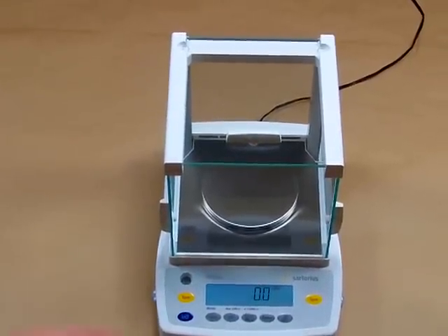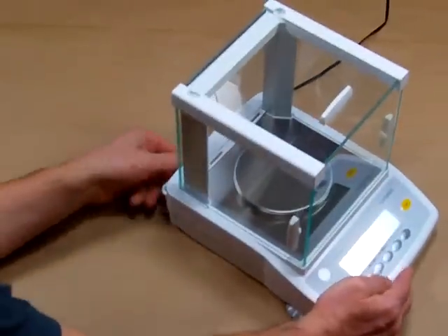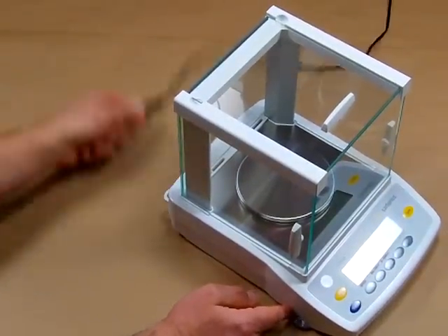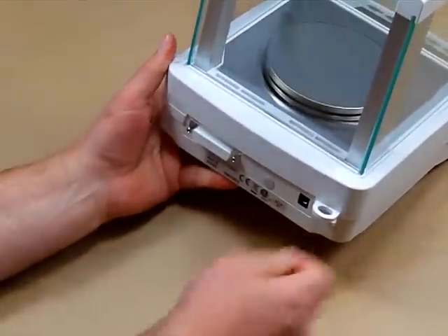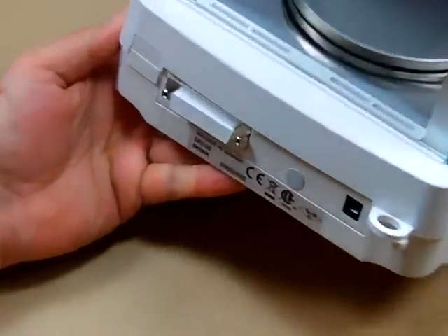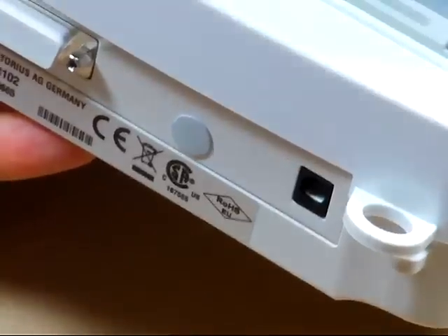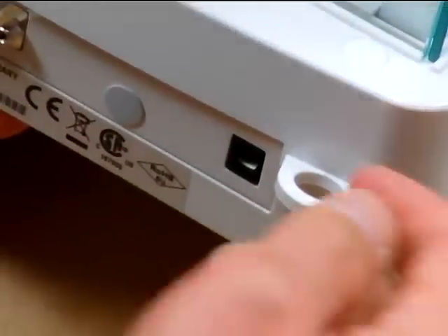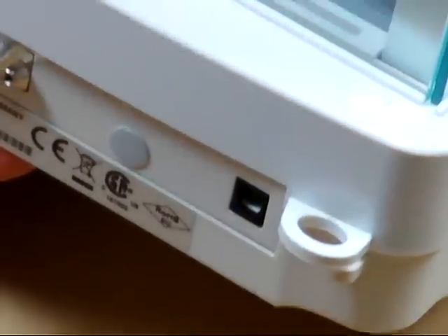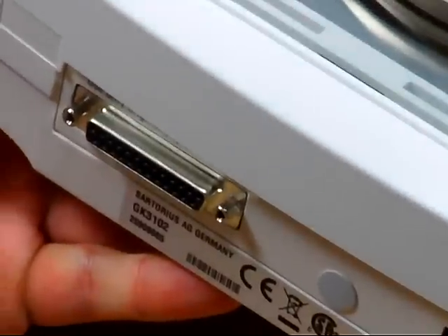In the rear of the balance, there is a port for a lock-in cable. If this balance is in an environment where someone might be stealing it, there's a lock-in cable from Sartorius available as an option. The cable goes through here and you can put a lock on it.